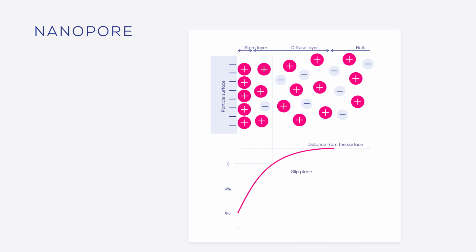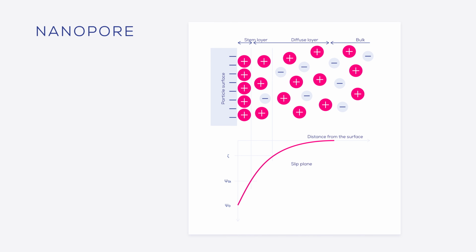Microscopically, it has the same cause as electroosmosis. Again, a double layer forms at the particle surface, and due to the applied electric field, a Coulomb force exerts a force on the ions. So, the force is not actually applied directly to the particle, but to the ions in a diffuse layer located at some distance from the particle surface. It is then transferred to the particle surface through viscous stress, which results in the movement of the particle.